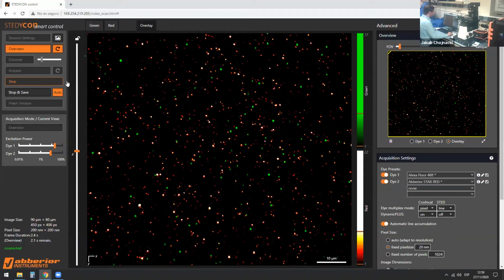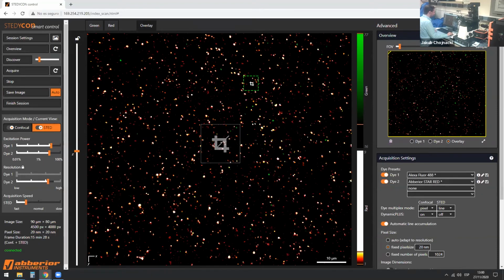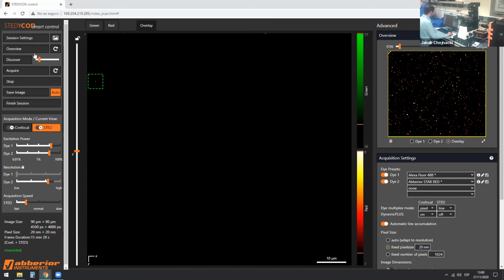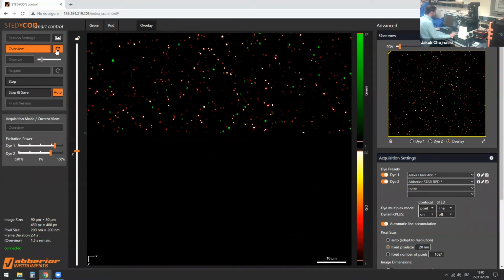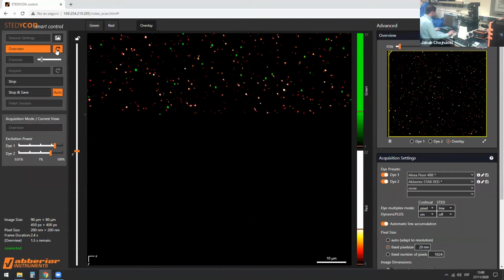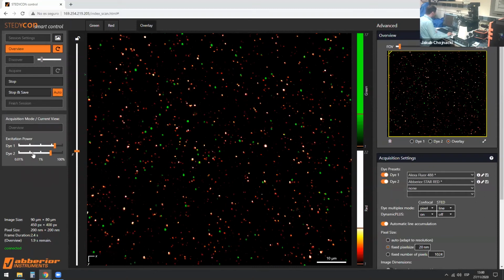But this is still one of the early models of those SARS-CoV-2 virus-like particles that we're studying, and it's a little bit imperfect. So that indicates that there is quite a lot of room for improvement in terms of studying these particular samples. Let me try somewhere else. Maybe I'll find something better. I haven't imaged this sample very much, but I can already see it's not as great as the HIV sample.